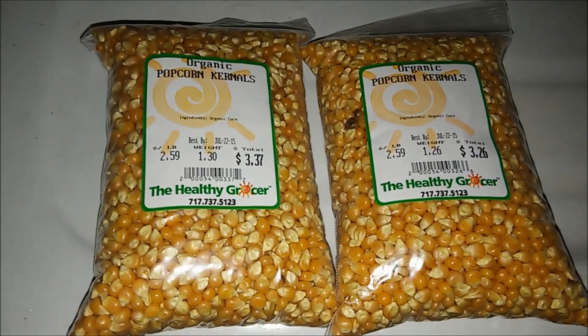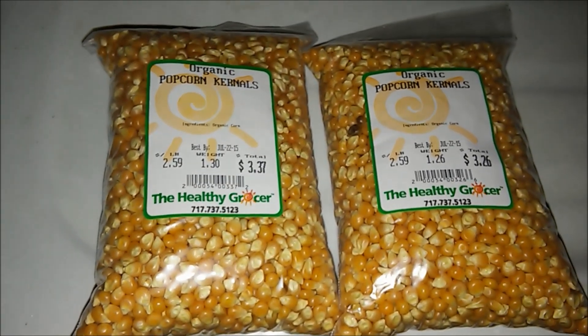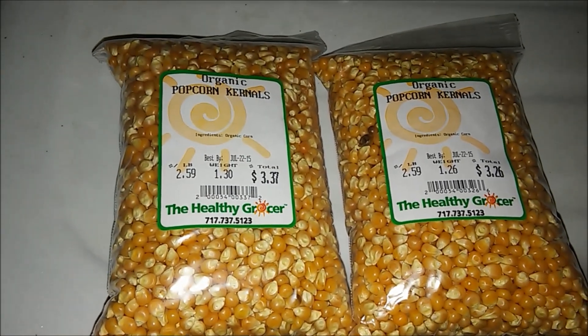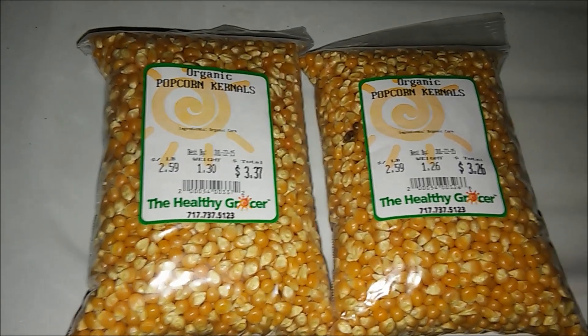Hey everybody, it's Will, and this video is going to be on how to prepare corn for multi-spore inoculation and liquid culture inoculation.